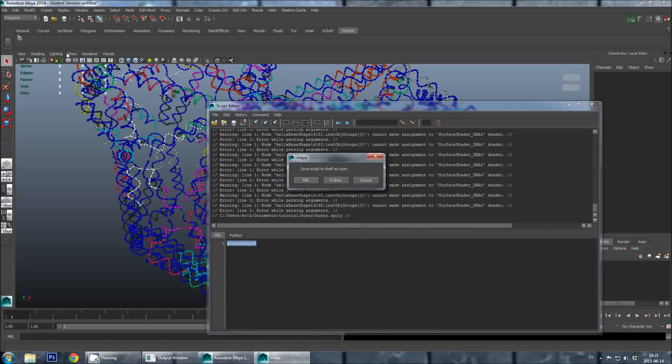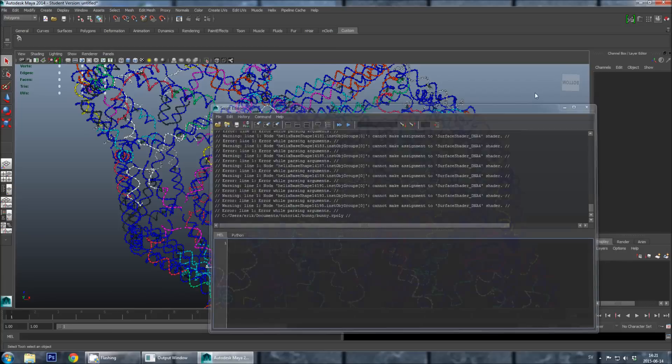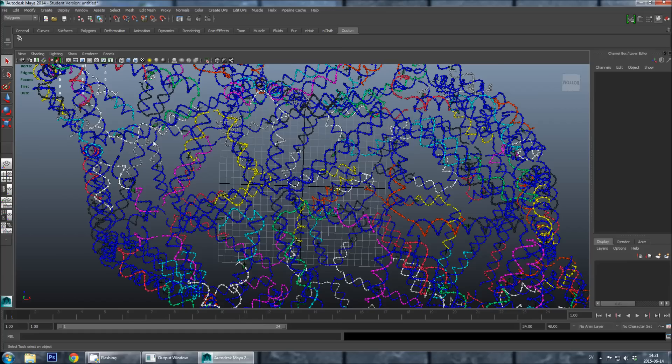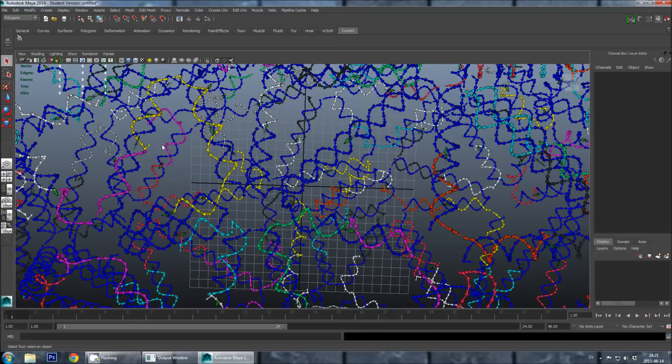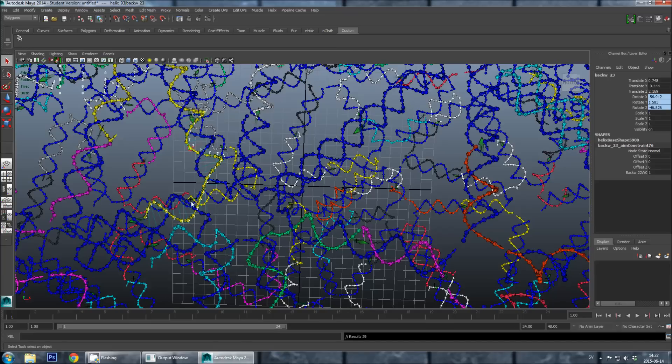And just drag it up to the custom shelf up here. And drop it. And then Maya will ask you what type of script is this, and you should select a mel script. But I will just select cancel, as I already have this feature. And what it will give you is an extra button in the custom shelf, which is called strand length. And if you now select a staple in the design, or the scaffold, and push this button, you will get the length of this strand as an output down here. So this strand is 29 bases long.